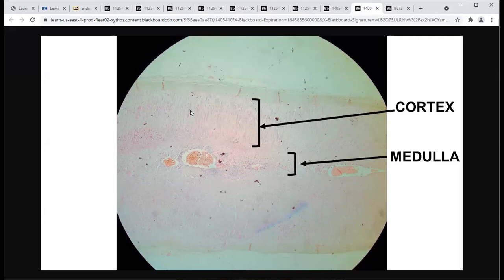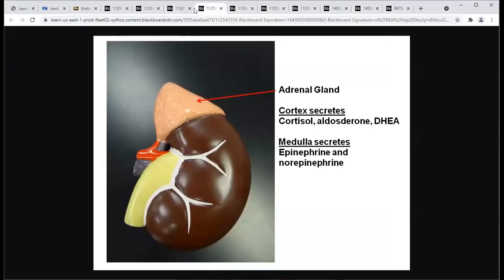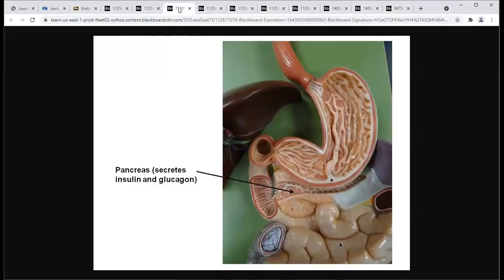So in terms of the truly full-time endocrine glands, we are done. We do have 3 part-time endocrine glands, the pancreas, ovaries, and testes on our schedule. So let me go to the pancreas first and see if I can find this. Nope, not quite. Right here. So this is one aspect of the pancreas. This is also visible on the Minotaur.